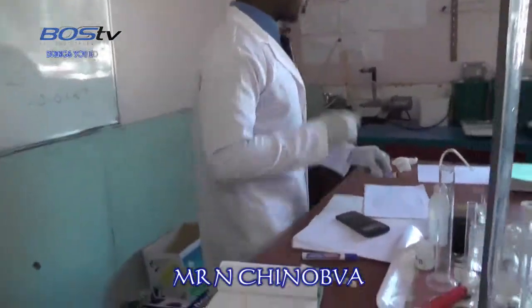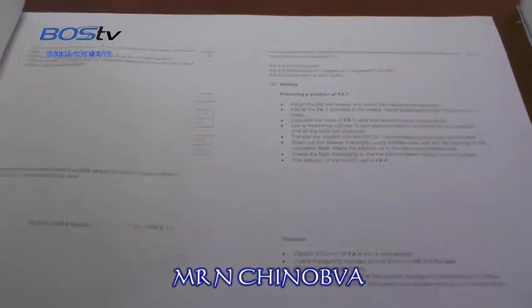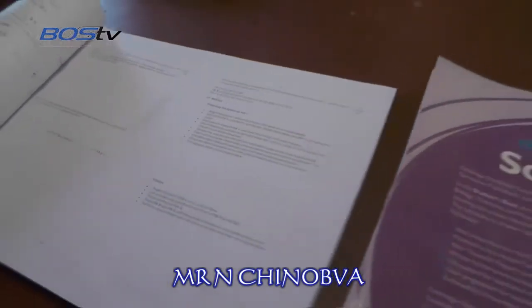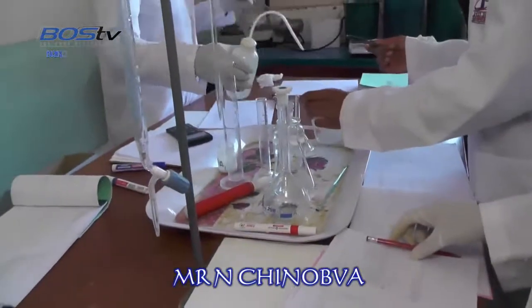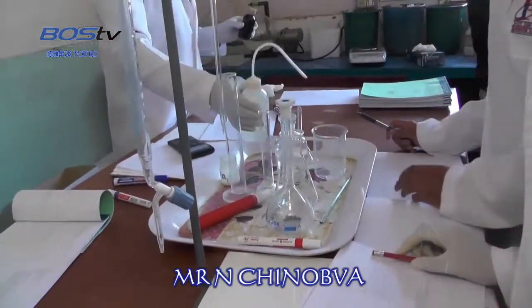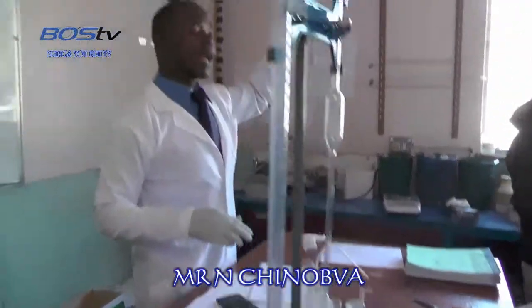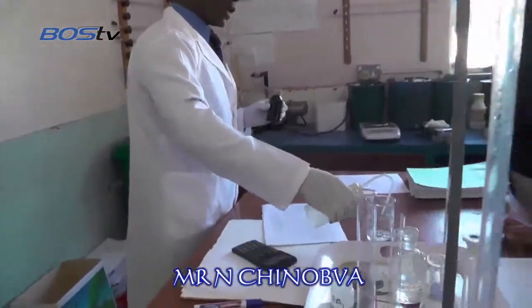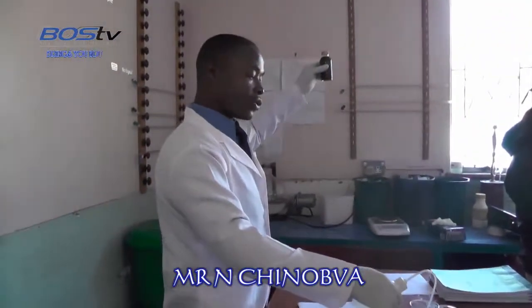Now, how are we going to recognize our endpoint? This is our FA2. Yes, this is your FA2, your potassium permanganate. It's colored and it's deep purple. Now, how are we going to identify our endpoint? Since this one is colored, we don't need an indicator. So our endpoint, we are going to identify it by the appearance of a permanent pink color.